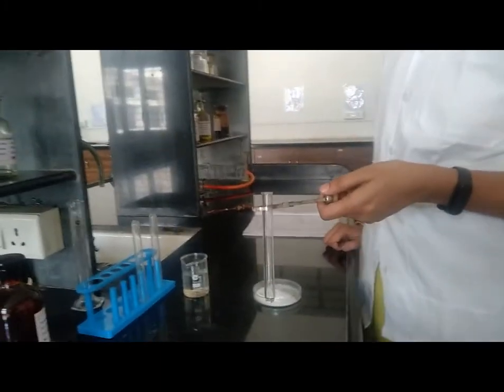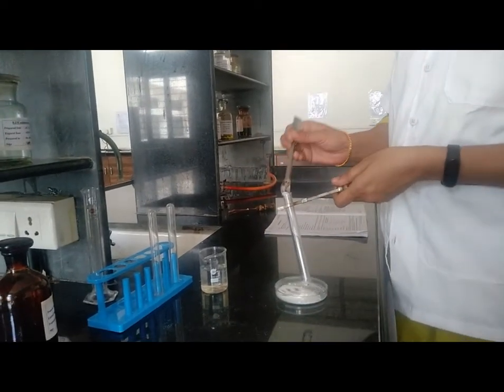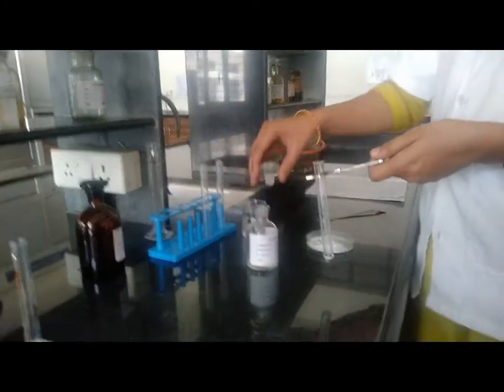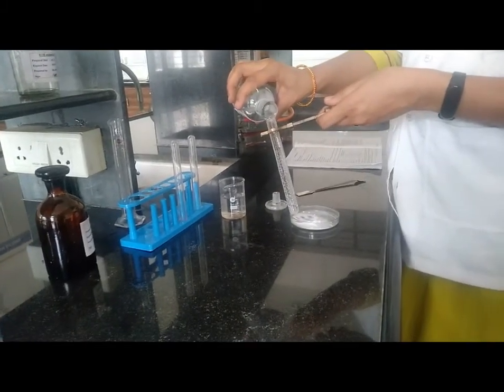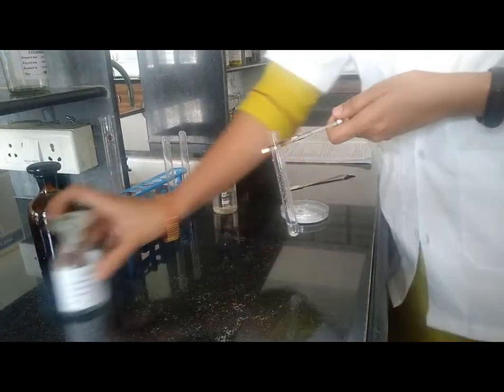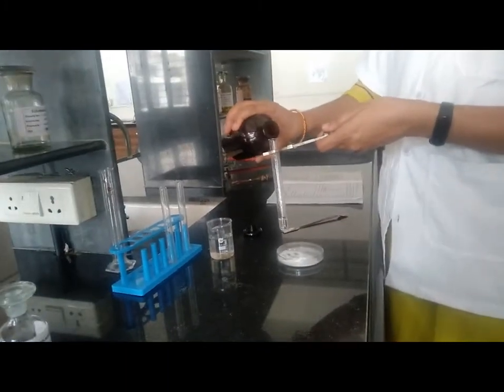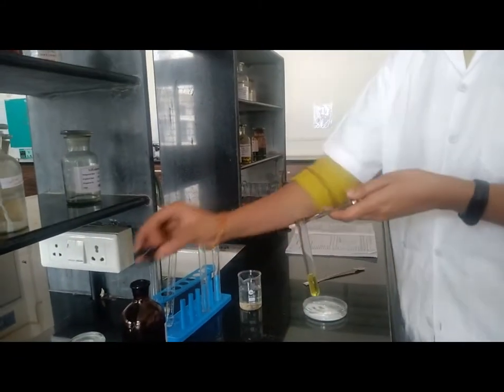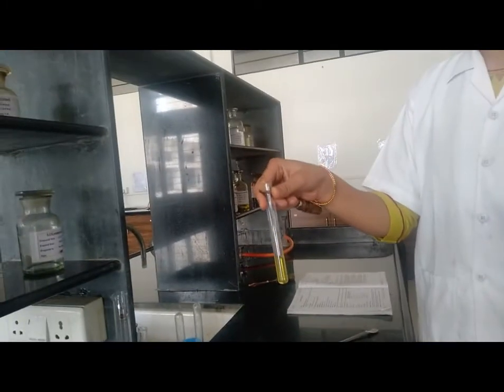Now next test: we have to acidify the solution containing our compound with 1 molar acetic acid. For that we have to take sample, then add 1 molar acetic acid for acidifying. Then add excess of magnesium uranyl acetate. After addition of excess of magnesium uranyl acetate, we got yellow precipitate.